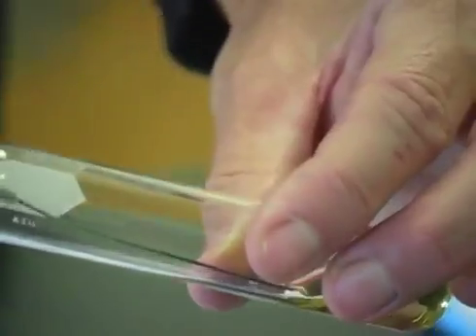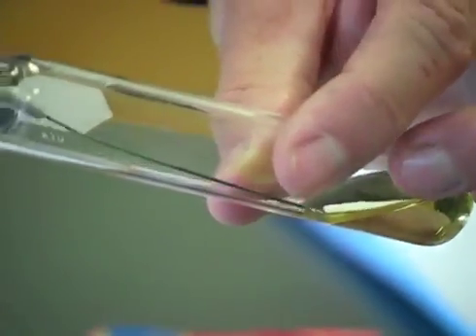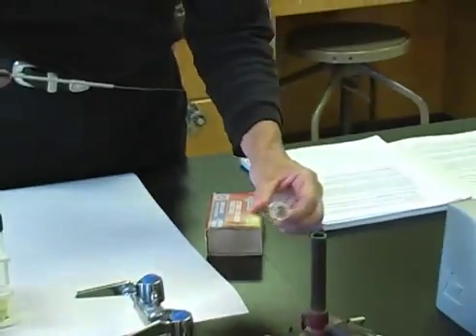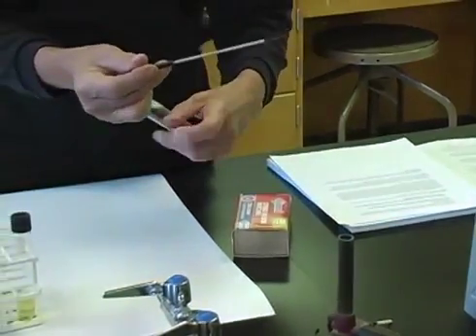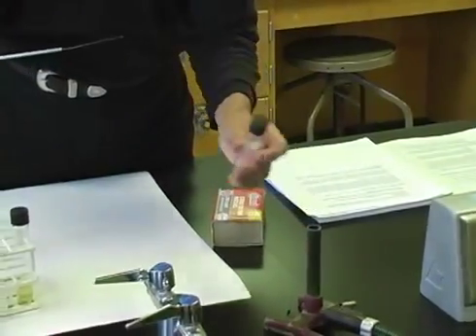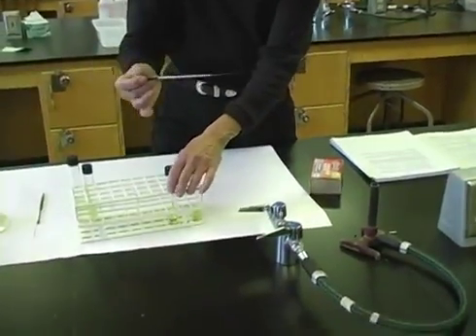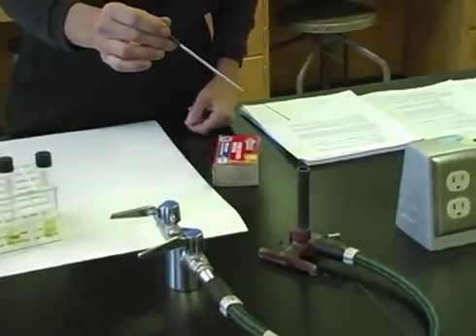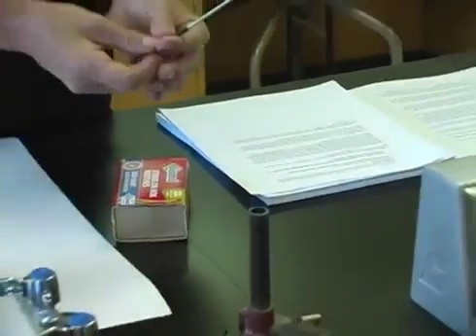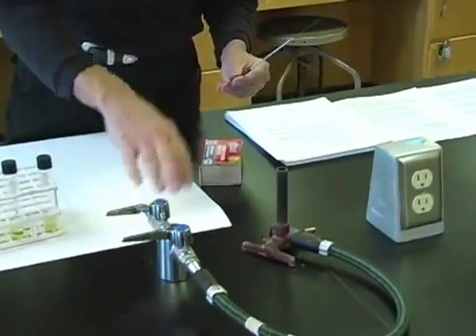I'll immerse my loop with the microbes it contains in the fresh broth, withdraw my loop, flame the lips 3 times, replace the cap, flame the cap 3 times, and very importantly I need to flame my loop to kill any of the microbes that still remain. And once again, we'll lightly flame the handle. Turn off the Bunsen burner when you're finished.